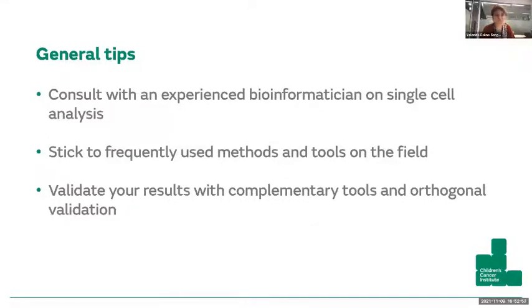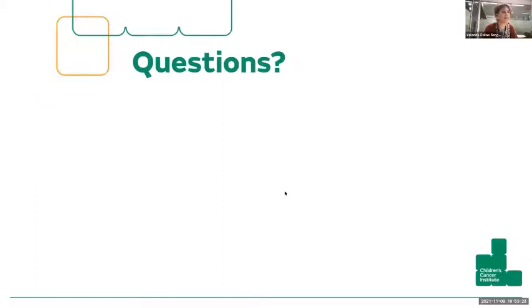Then, this is very much common sense, but stick to the frequently used methods and tools in the field, because the reviewers will be more willing to accept that that is correct. And if you can, validate your results with a complementary tool, or do orthogonal validation of your findings in single-cell RNA-seq. And with that, I think I'm almost 1 hour up.